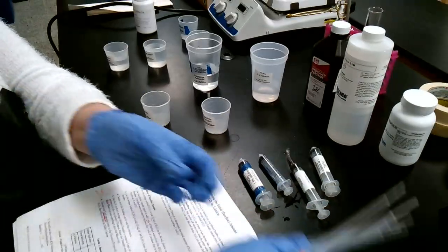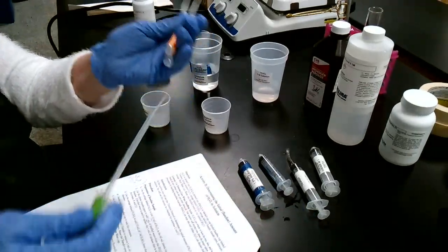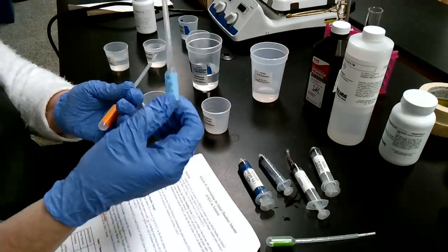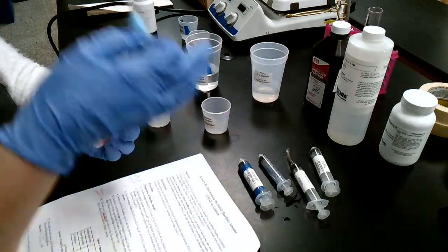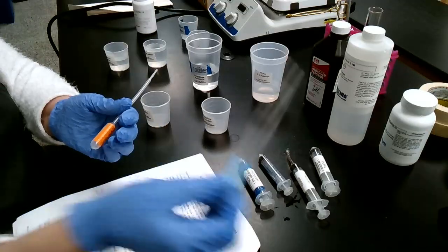As for pipettes, you have a couple of blank ones that I don't have labeled. You have one labeled transfer. You can use that one, but I like using the one that says distilled water, because a lot of times they'll say use the transfer to transfer over distilled water. Now, I say if you're using distilled water, use a distilled water one.